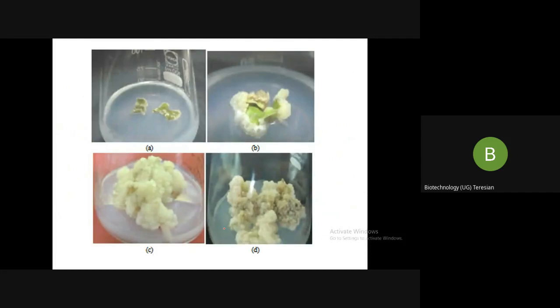See, this is a very good example of your callus, how it is growing. Look at this. This is your explant. I'll simply explain this part. It is quite interesting. Freshly cut pieces from a surface sterilized plant or any organ are placed in the nutrient media. This is your nutrient media. It has agar. Here it is the leaf which we have used.